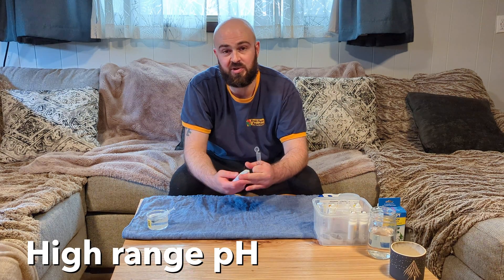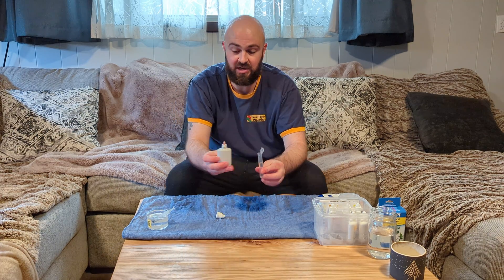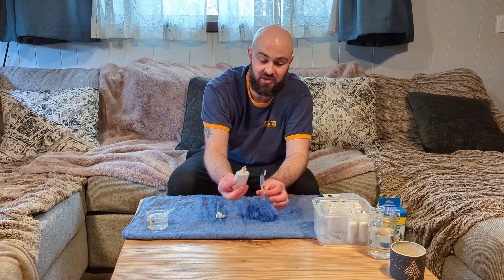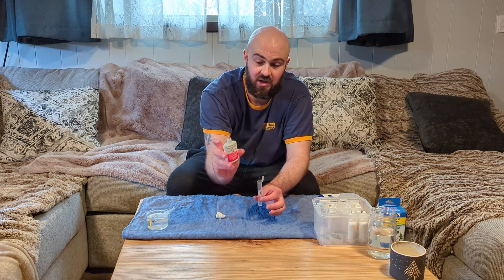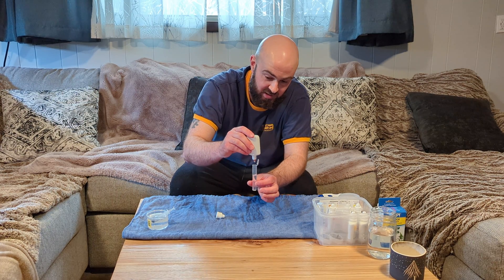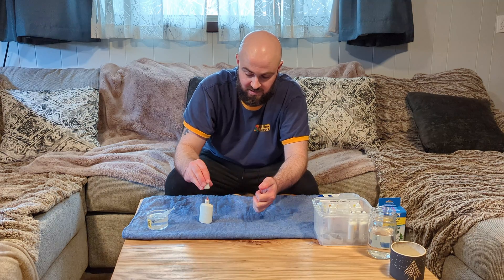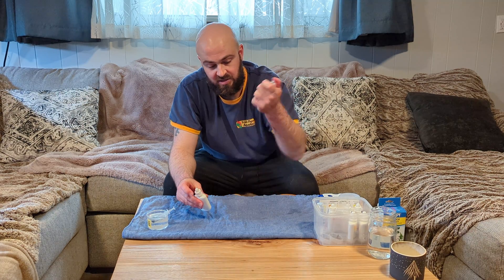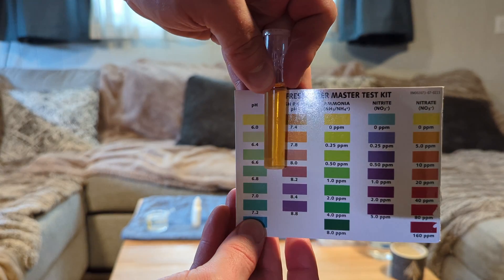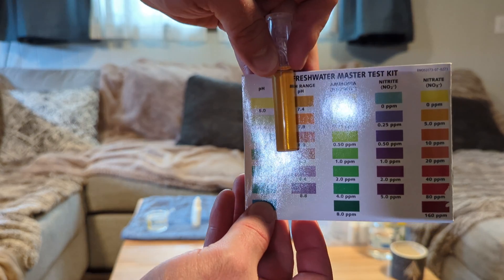The high range pH test is pretty easy. All you do is add five drops, and when you add them in, you need to make sure that whatever dropper you're using is completely vertical. Invert it a few times. I'd say that's a 7.4 or 7.8 — pretty much what I'd expect.